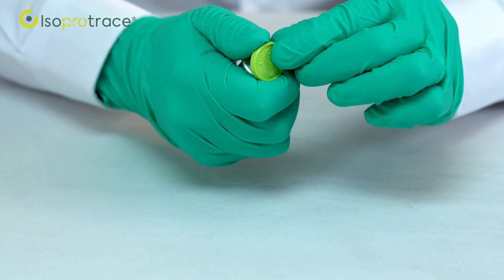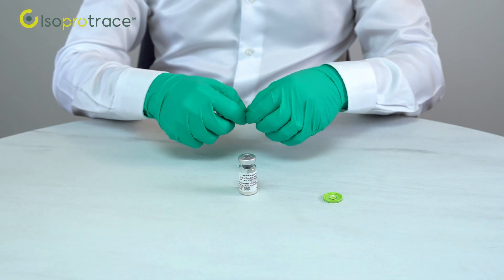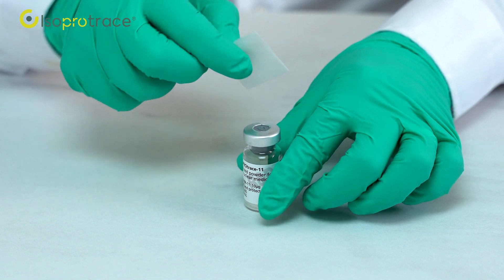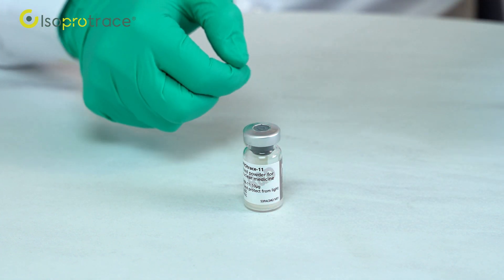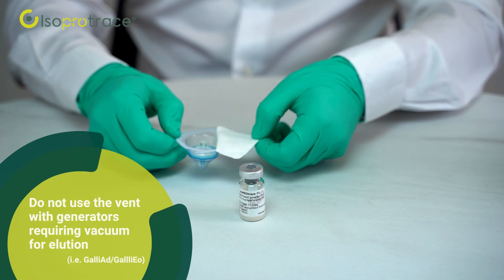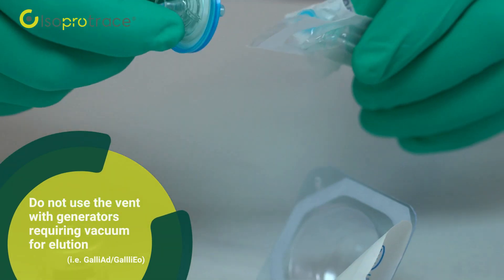Remove the flip-off cap from the product vial. Sanitize the rubber stopper with a 70% alcohol pad and allow to dry. Connect a 0.2 micron vent filter to a short sterile needle and inject the vial.